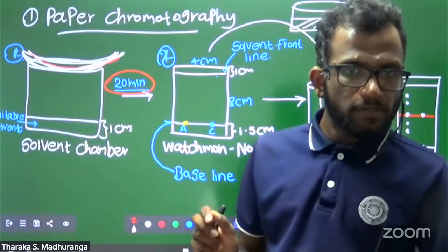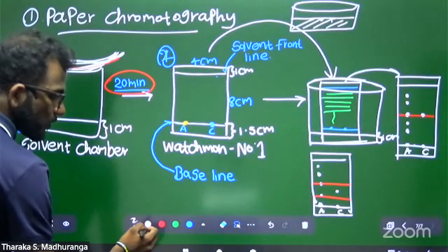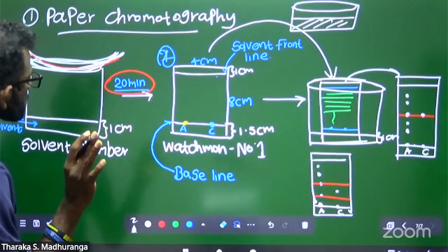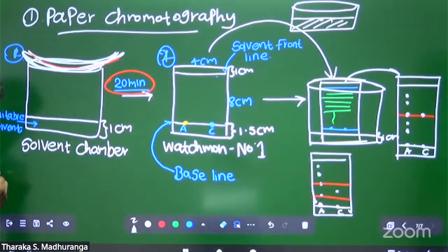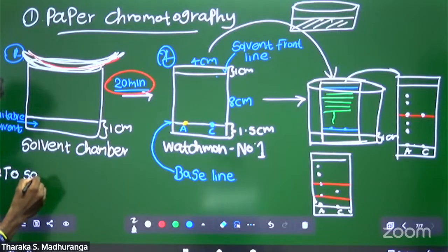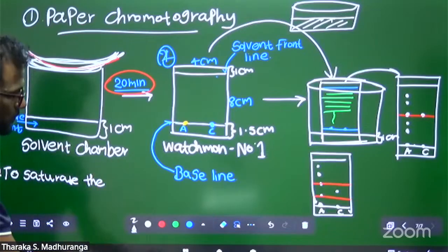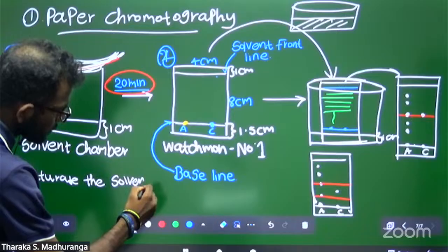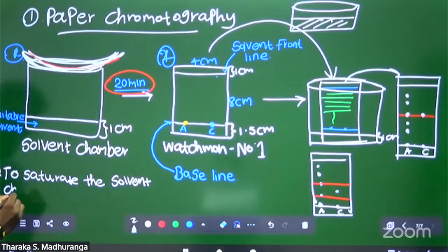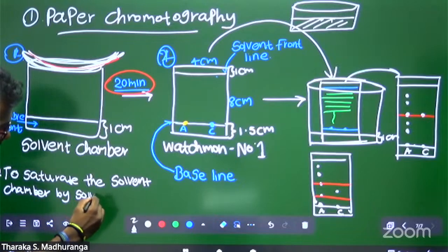Write down like this: keep closed for 20 minutes. That's the reason. To saturate the solvent chamber with solvent vapor.